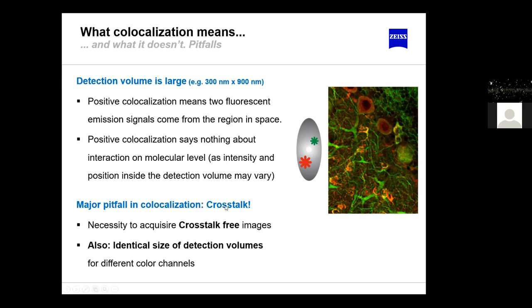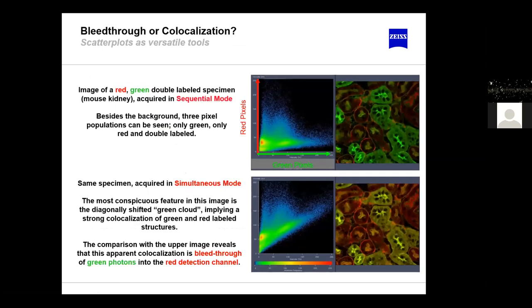A major pitfall in co-localization is crosstalk. It is absolutely necessary to acquire crosstalk-free images or at least compensate for crosstalk. We also need identical detection volume sizes for different color channels. Channel misalignment — for example if all red images are three pixels shifted from the green — will give rise to artifacts and misinterpretations.